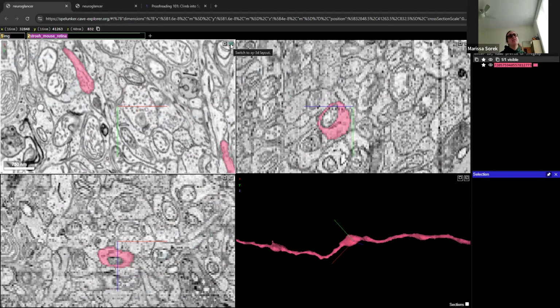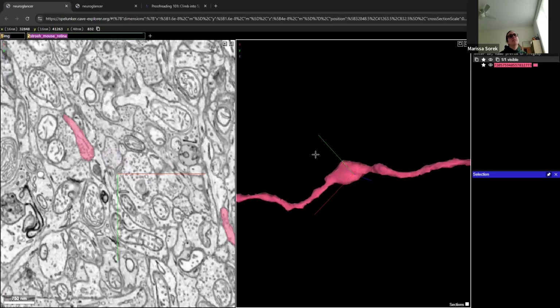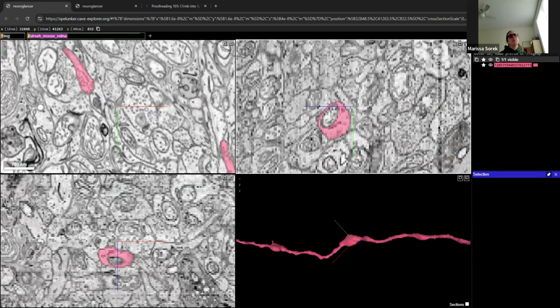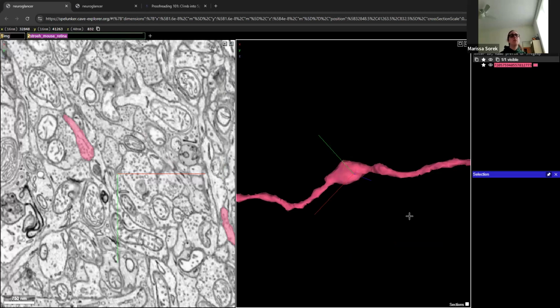And to get to that, you can use these little buttons up top here in the upper right corner. And here we can switch back to our side-by-side layout. You can also use them to go to the other layouts too, and things like that. So just know that these are here for navigating around. A lot of people, if you're wanting to take a beautiful screenshot, will enlarge their 3D in order to take a nice one of all the cells of interest for them.